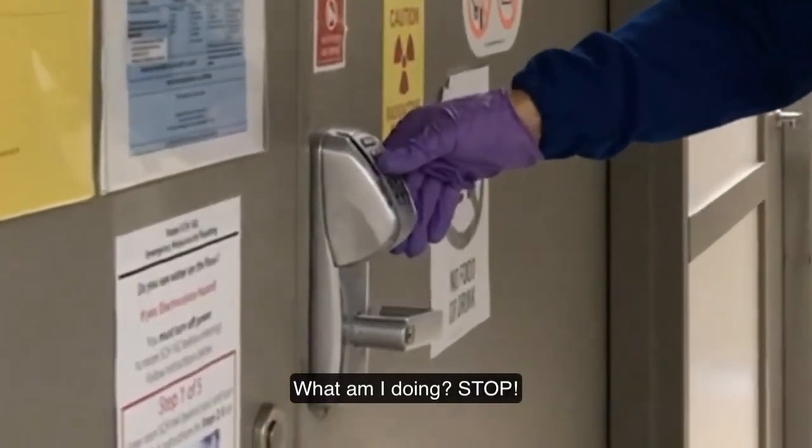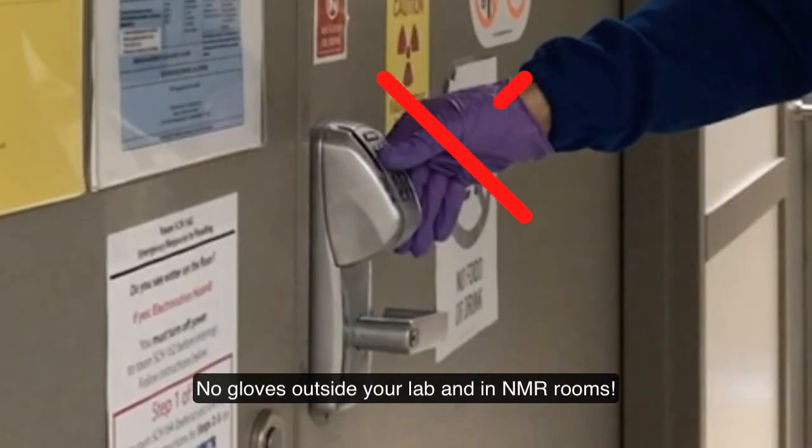Stop! This is just another reminder: no gloves outside your lab and in NMR rooms.